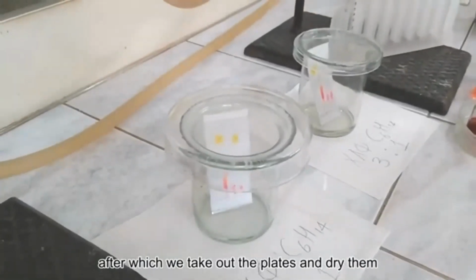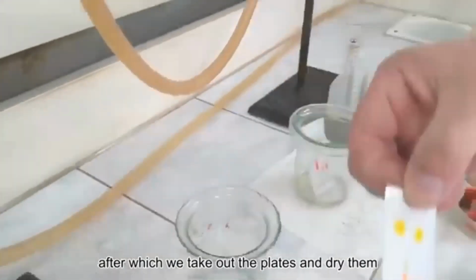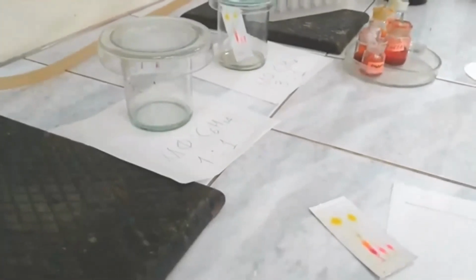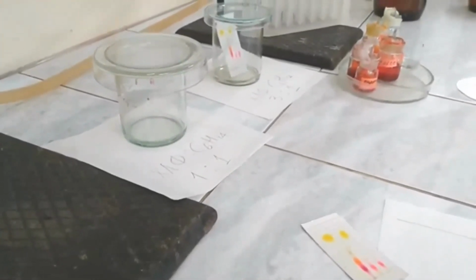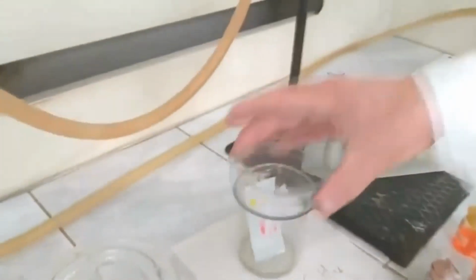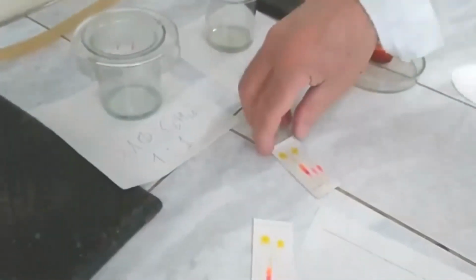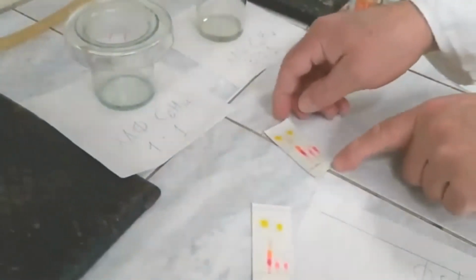Время подошло. Черта. Извлекаем на сушку. Сейчас вторая подоспеет. Просто высохнуть должна. Можно, в принципе, уже ее трясти. Ничего страшного. Вот вторая подходит. Крышку достаем, пластину. Уже не страшно. Пятна разошлись.